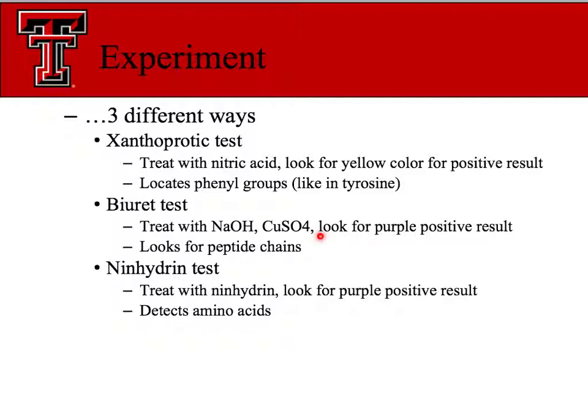Ninhydrin, we'll treat it with ninhydrin and look for a purple positive result, and this detects amino acids in general.